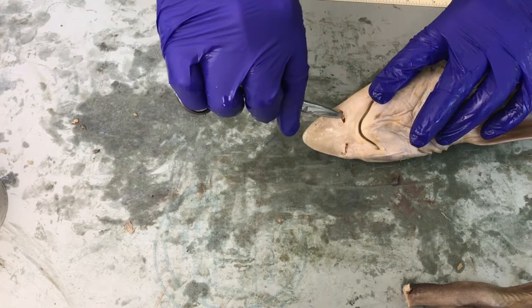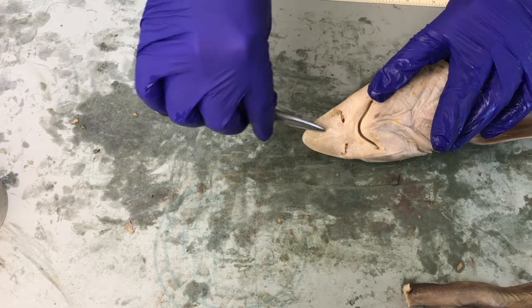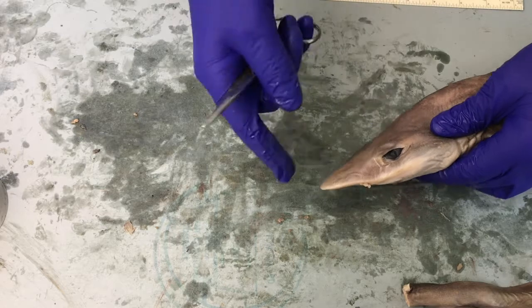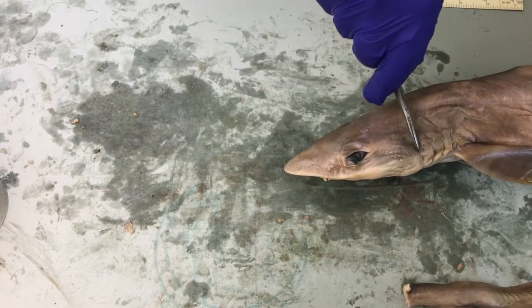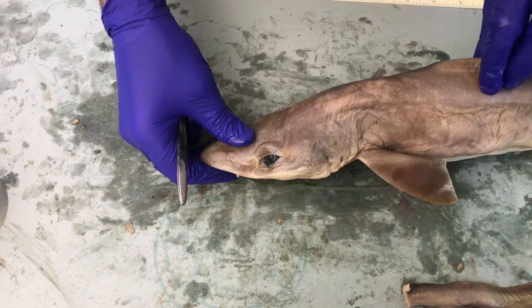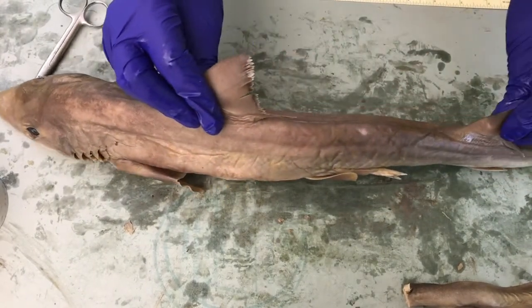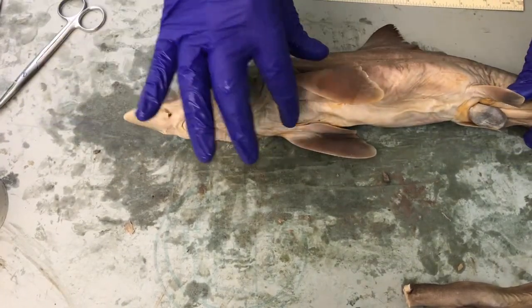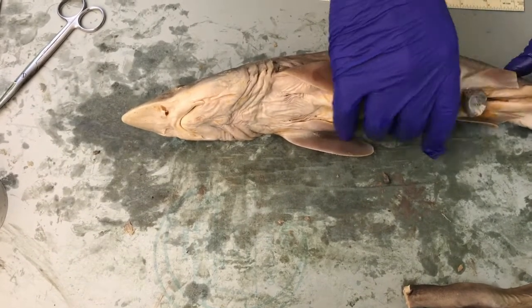The nares, the external nares or the nostrils, do not lead back into the throat. They just pick up chemical signals to the olfactory bulbs up here, and we'll see a little bit of the brain later. But the gill slits with gills deep in, obviously, right? And the pectoral fin, first dorsal fin, second dorsal fin, and then we have the pelvic fin. So back here again, pectoral, pelvic, a little bit of the intestine sticking out there.